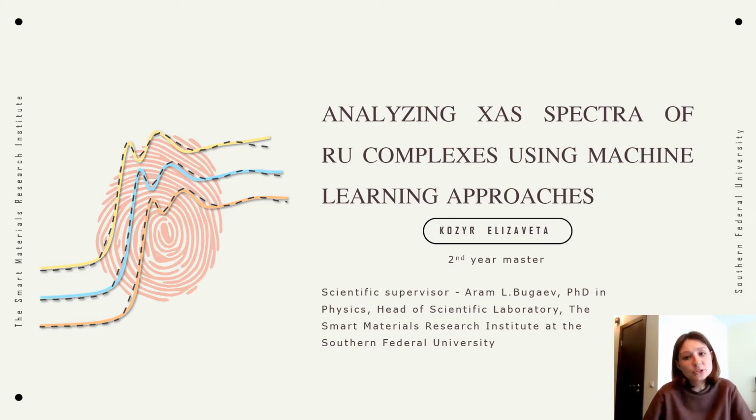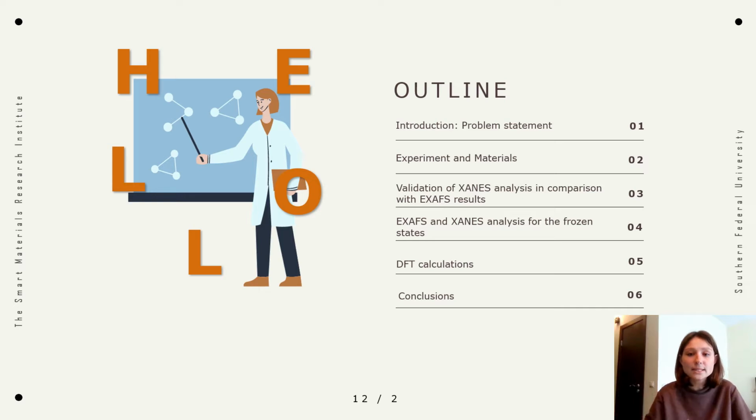Hello, I would like to introduce my research topic: analyzing XANES spectra of ruthenium complexes using machine learning approaches. My work is aimed at developing machine learning approaches for the analysis of ruthenium XANES spectra, as well as studying the evolution of ruthenium catalyst.